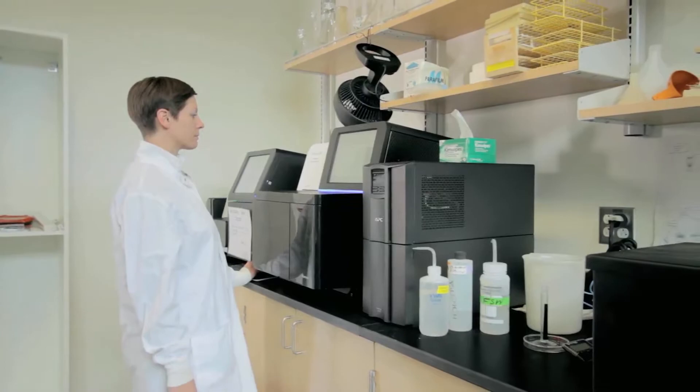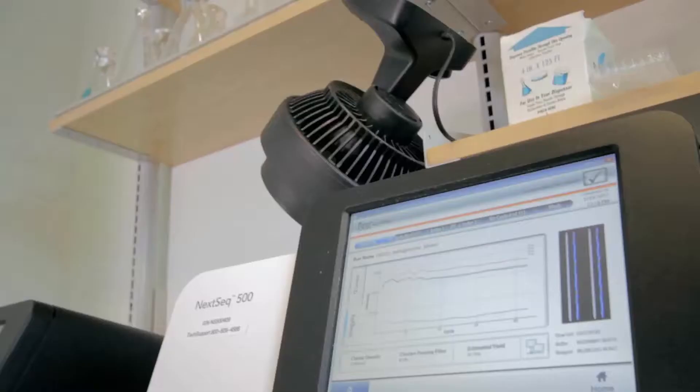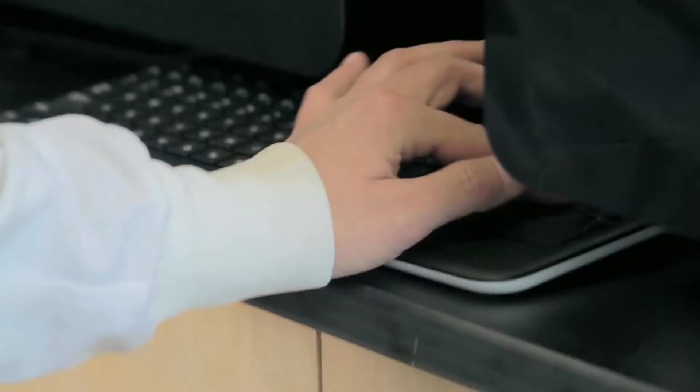When genomic libraries are ready, they are analyzed by one of SCGC's genomic sequencers. Currently, we utilize Illumina NextSeq 500 and MiSeq instruments. Illumina genomic sequencers read the four genetic letters of millions of short DNA fragments. Each fragment is a few hundreds of nucleotides long.